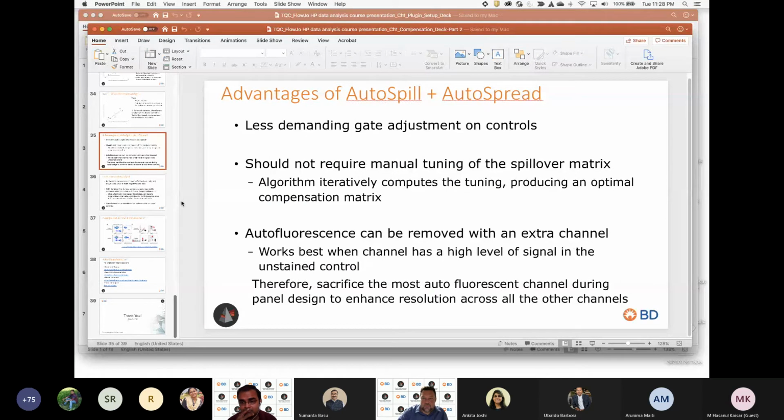I'm so sorry. We have one more option: E, A, B, and C all are correct. I didn't see that. Sorry. We can see different responses here. Most of them are saying option E, which is A, B, and C are correct. Some are saying B and C are correct, and others are at 0. So the correct answer to this is both B and C are correct.